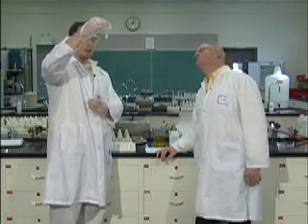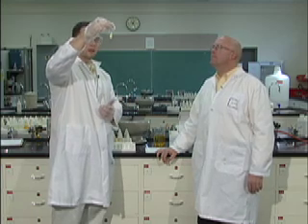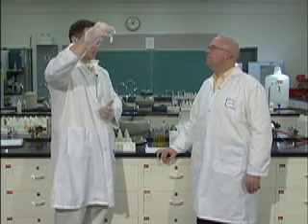Now, obviously, when we added hydrochloric acid to this, we got a solid formed. It does look like it's cloudy. Cloudy, yeah. So as soon as it's cloudy, you know that there's some sort of solid in there. So what we're going to do to this is we're going to centrifuge this mixture.